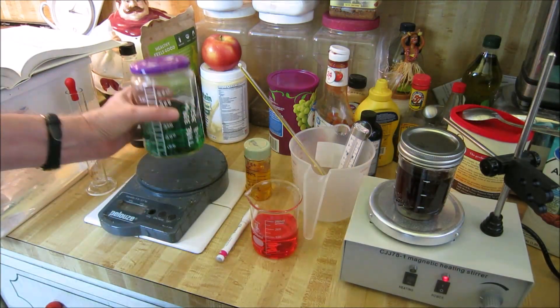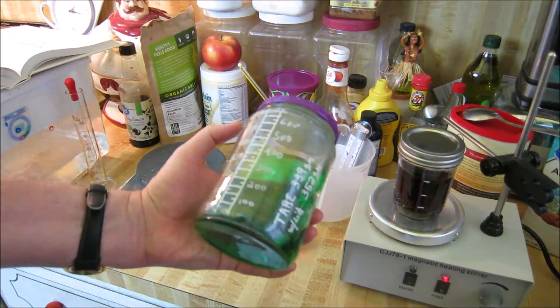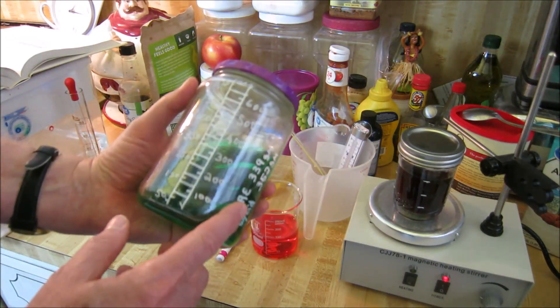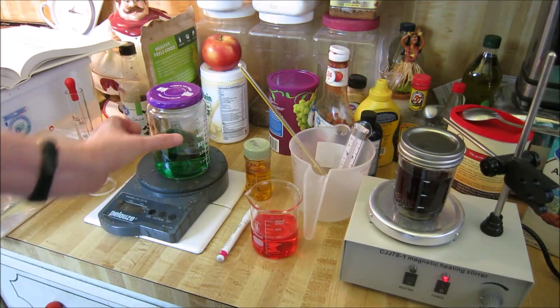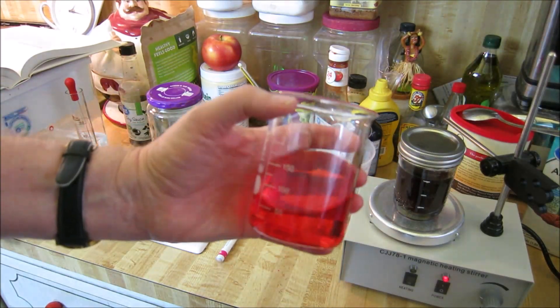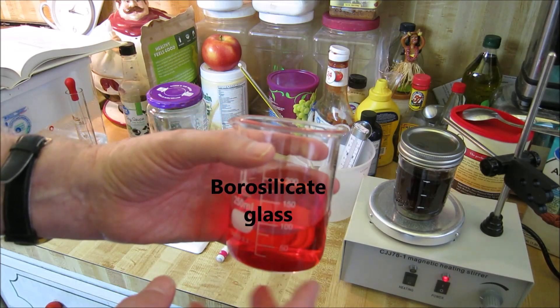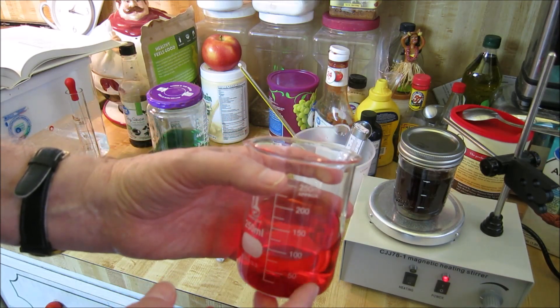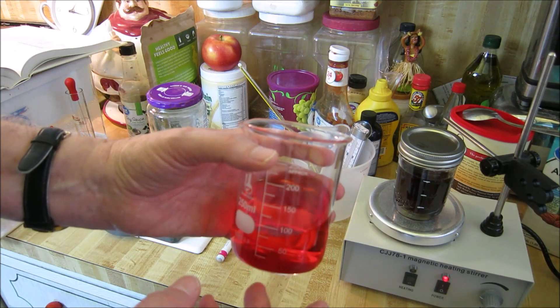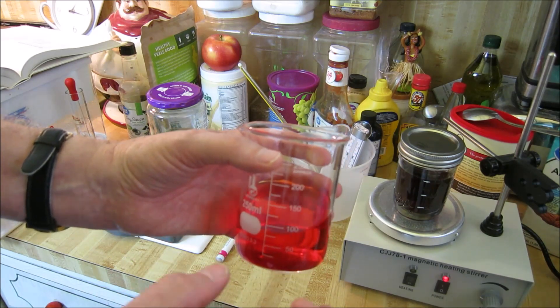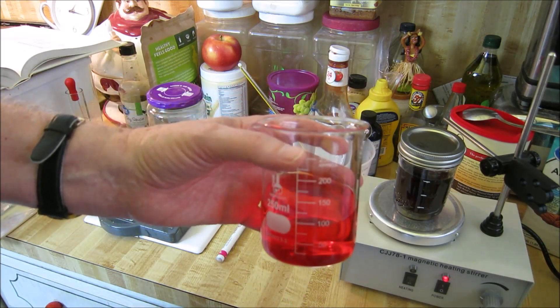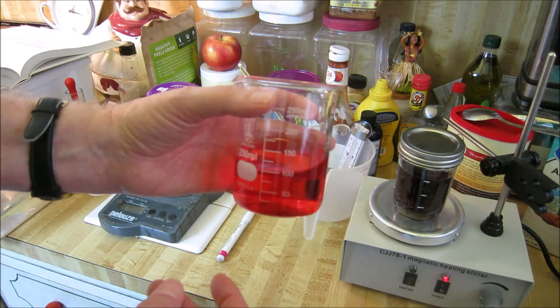If you have plain old plastic jars or glass jars, you can use them to make labware. However, they're not as good as normal labware because normal labware is made with borosilicate glass. That means it's a glass that's very sturdy. Also, it can be heated to high temperatures and cooled frequently back and forth and it doesn't fracture. You can put it in a microwave, you can put a flame on it and it shouldn't fracture.